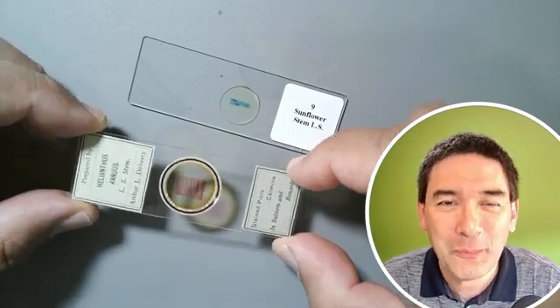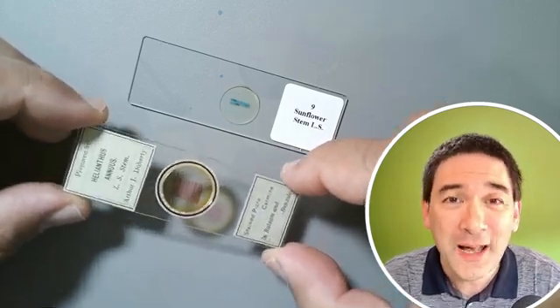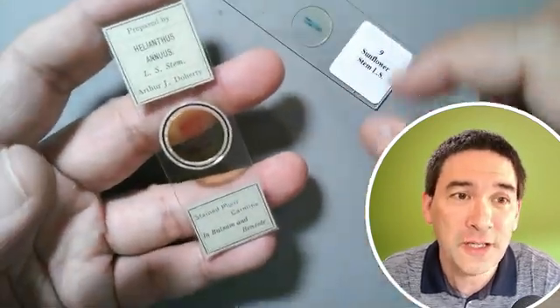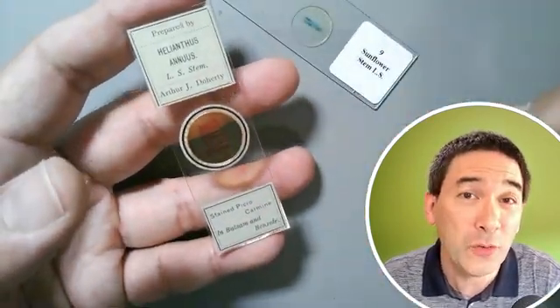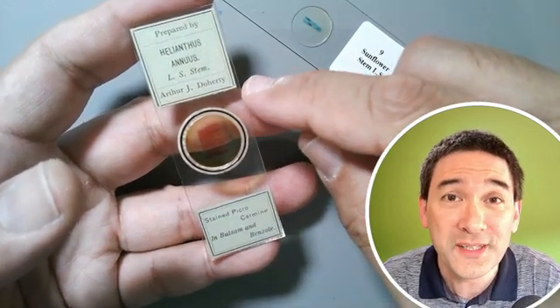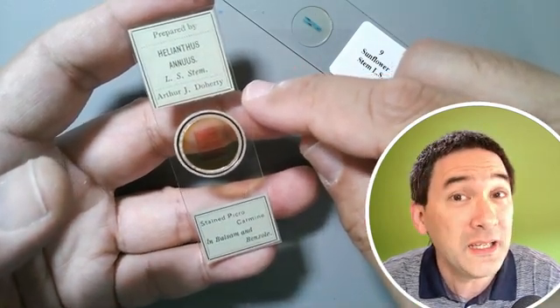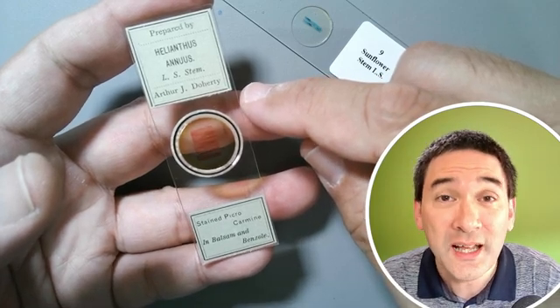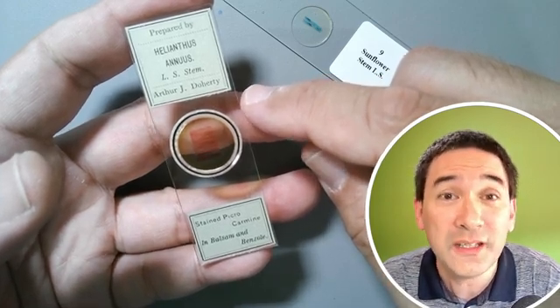Hi, hello and welcome — Microbe Hunter here. A little bit of background information: this antique microscope slide is over 120 years old, and I know that because the manufacturer of this slide died back in the year 1906 and he was selling slides until approximately the year 1900.